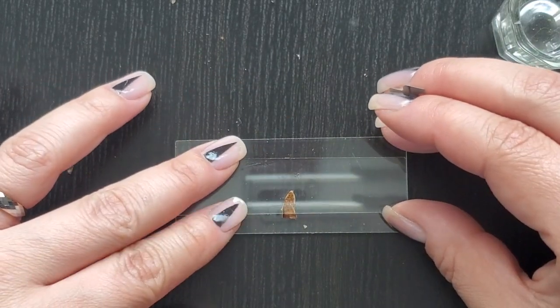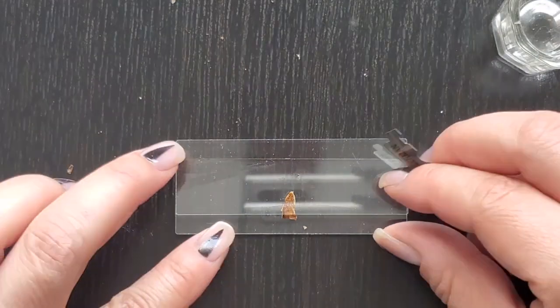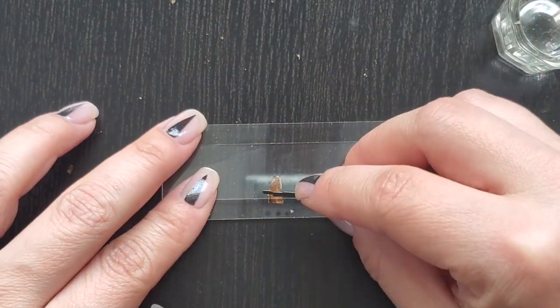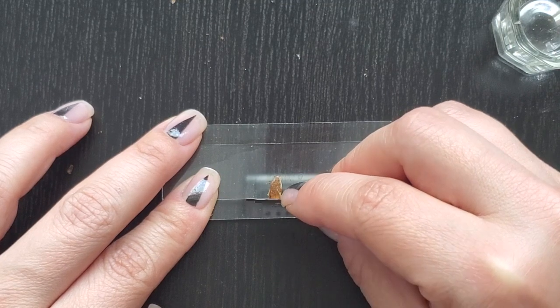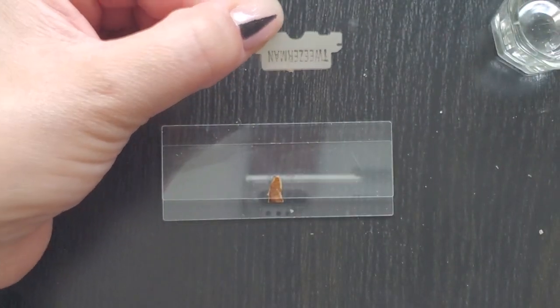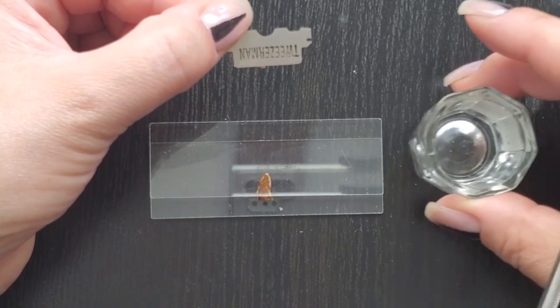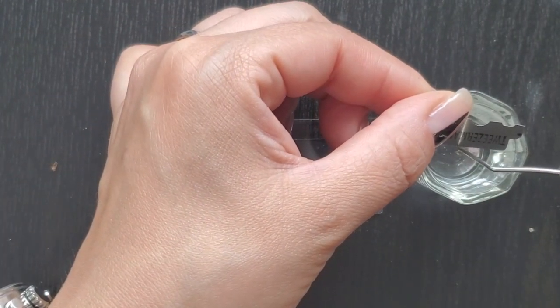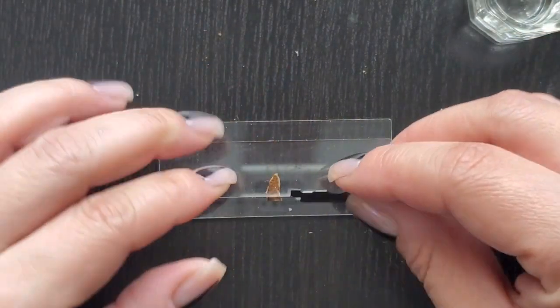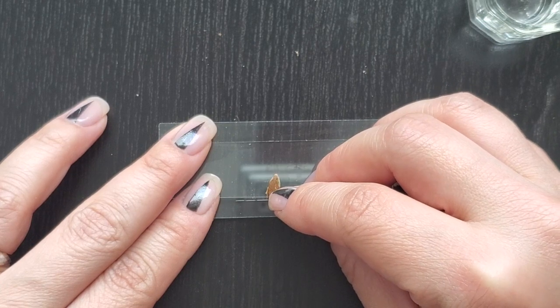Now for this tutorial, I'm not going to be hunched over my slide the way I normally am, because it defeats the purpose of showing you how to do it, but I usually get really close and with my head practically right on top of it. Okay, so there's already one here. It's huge though, and I know that it is because I can see it. Oops. Stop moving. So I can place it in here, but it's probably too big. And we're going to keep doing this until you do as many as you can. Take your time or go fast, whatever helps you make really thin sections.